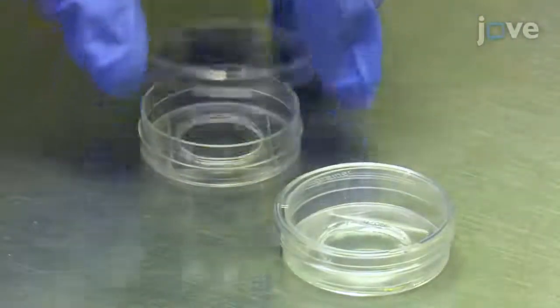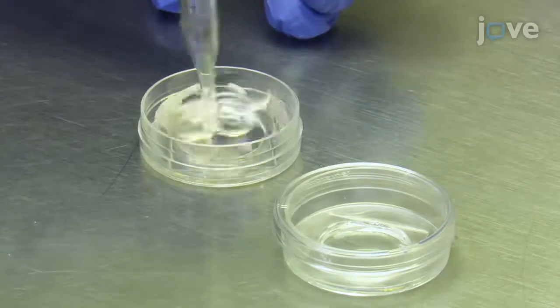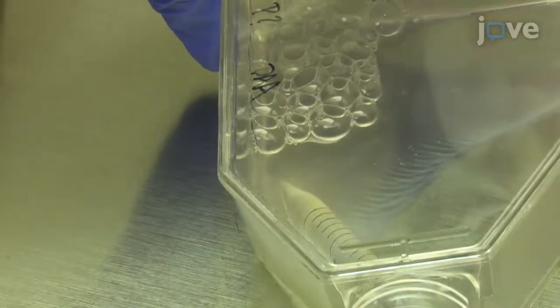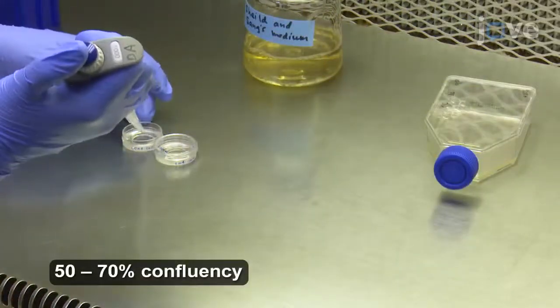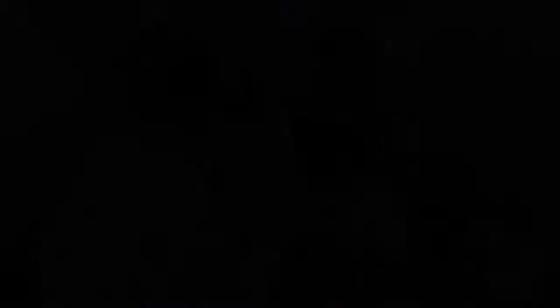Add approximately 2 milliliters of fresh cell culture media to each of the glass-bottom dishes. Then, re-suspend the S2R Plus cells by pipetting the cell culture medium up and down. Transfer the re-suspended S2R Plus cells to the prepared glass-bottom dishes, then check the cell density under a tissue culture microscope.